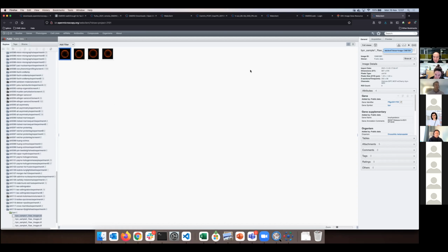Okay. But it might be that in your case, Janelle, I don't know if this is the case. We used to have the concept of sharing, because the workflow that Peter is describing is for, at that stage, anybody you want. But if you want to restrict it to, say, 5 potential collaborators, you give them that link only to those 5 people.